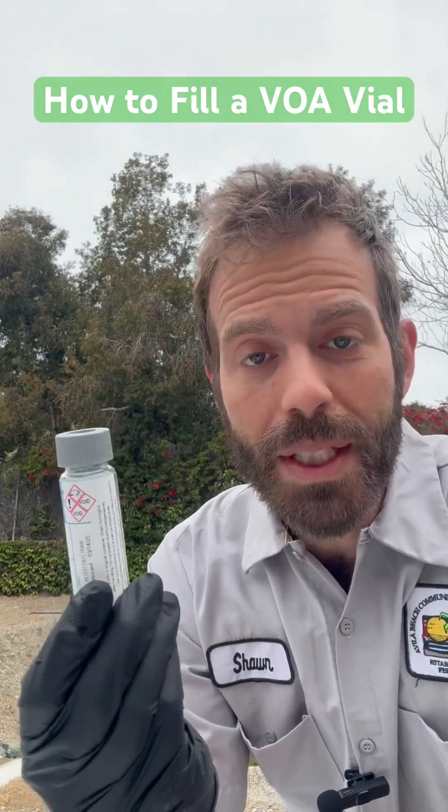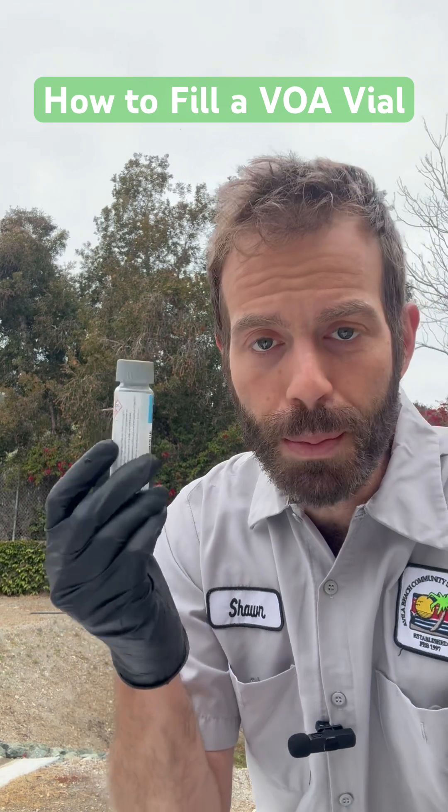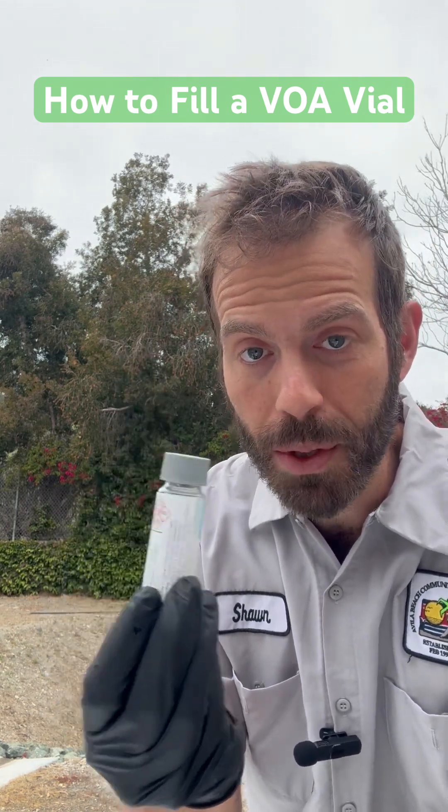This is a VOA vial. VOA stands for Volatile Organic Analysis. There are two objectives when you fill one of these. One is zero headspace, meaning no air bubbles at all.